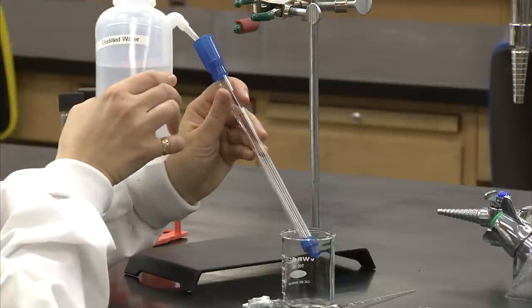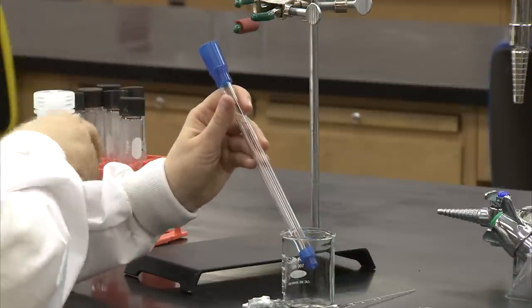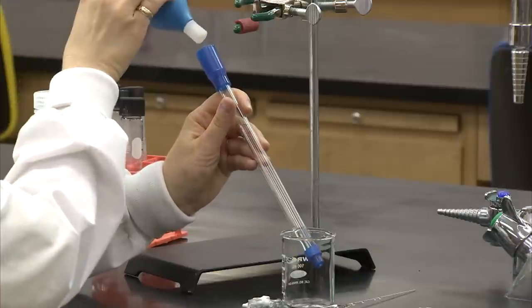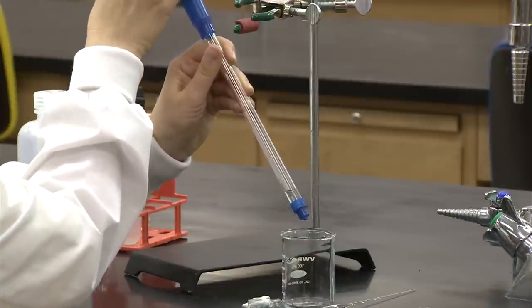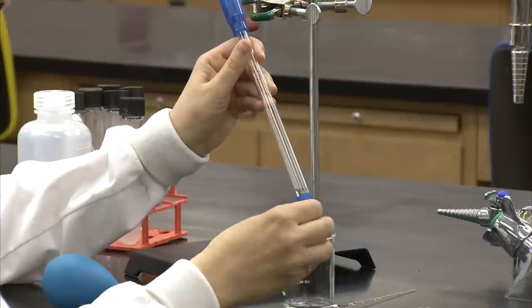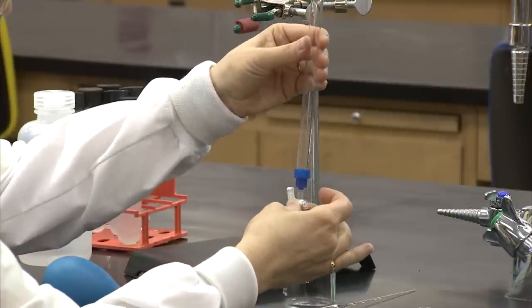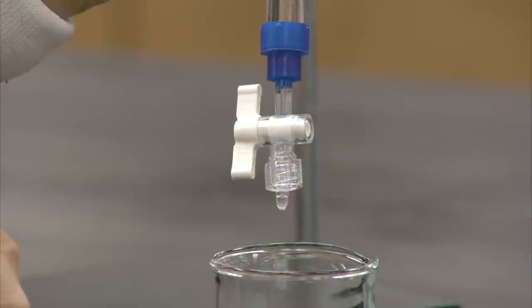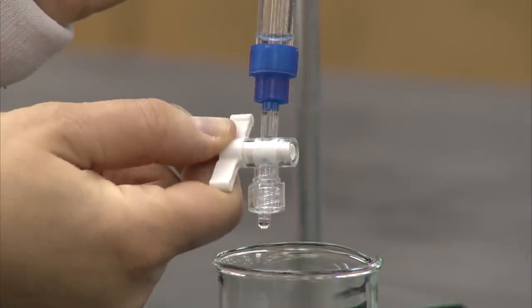To begin, the column should be rinsed with water to ensure that it will flow out of the bottom filter. You may need to use a bulb to start the flow, or you could simply place your palm over the top and push down. The next step is to attach the valve by screwing it to the bottom of the column. After the water has flowed out, you can close the valve and attach the column to the stand.